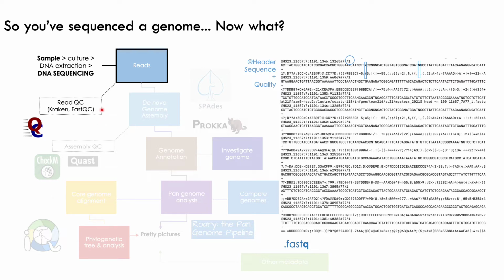We have some quality control steps that we can do at this stage, and one of them is called FastQC, where obviously it's not very efficient to open every read file for every sample and look at it like this. It's not very quantitative, so FastQC and another program called MultiQC will take all of your FASTQ files and essentially summarize the quality scores for you.